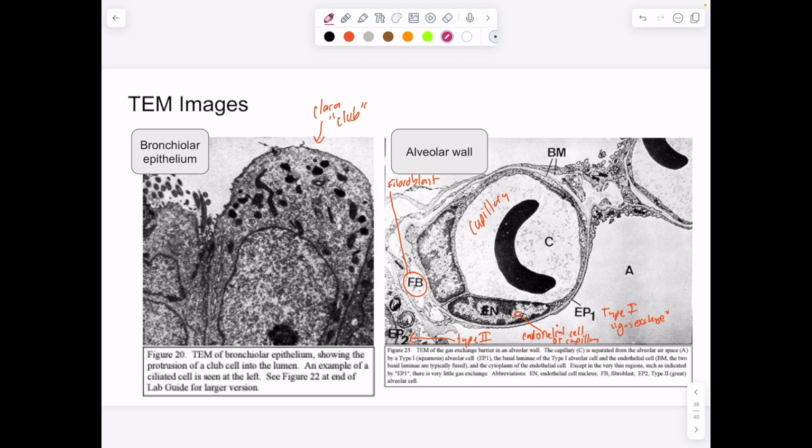All right, so bronchial epithelium. Again, this is bronchiolar, meaning not bronchus. We have our club cells, formerly called Clara cells, now called club cells. The round dome shape is our big hint. They produce watery secretions through chloride ion transport, like water follows chloride ions. So if you pump chloride ions out, water's going to follow onto the surface. They are reserve cells. They can divide into other things, and they produce a part of what makes up surfactant, although not surfactant itself. We're told that in lecture.